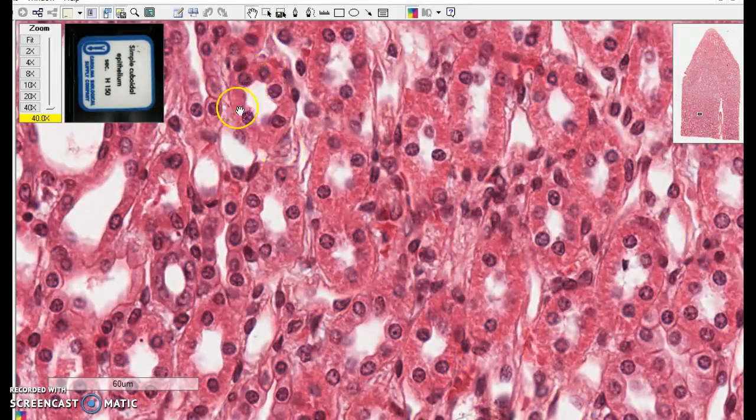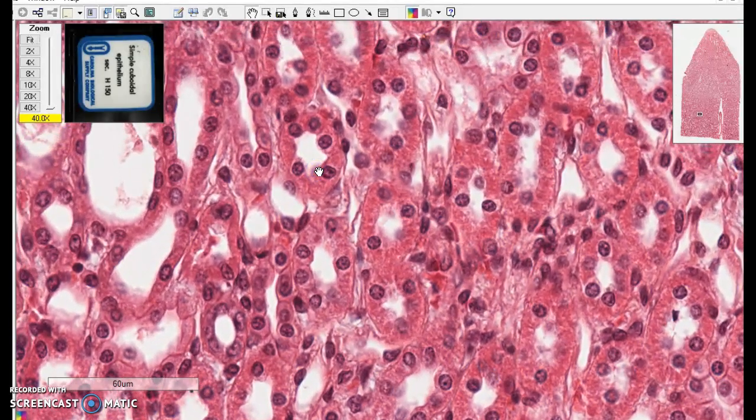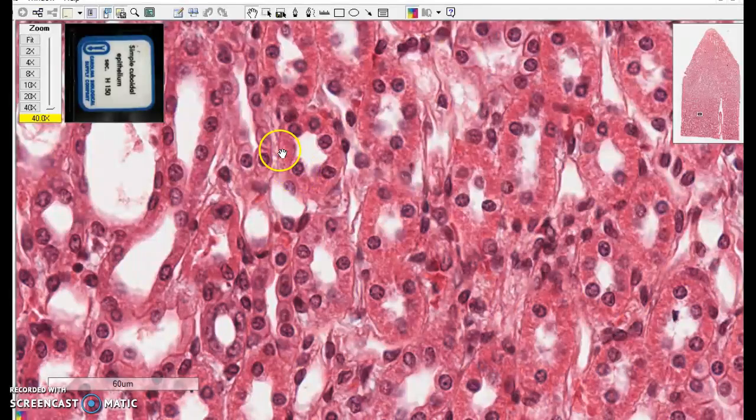Here's one there, here, here, here, here, here. And of course, where you don't see the nucleus, the slice has just gone in a part of the cell, up beneath or above the nucleus.